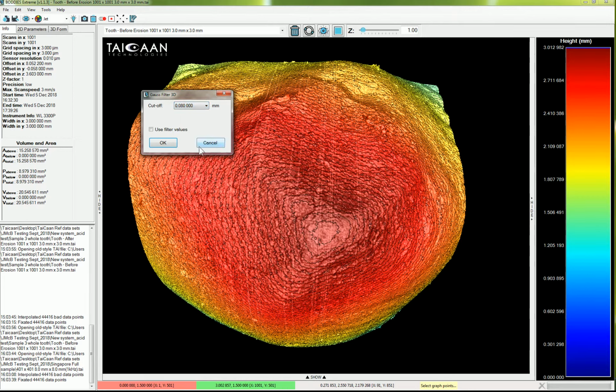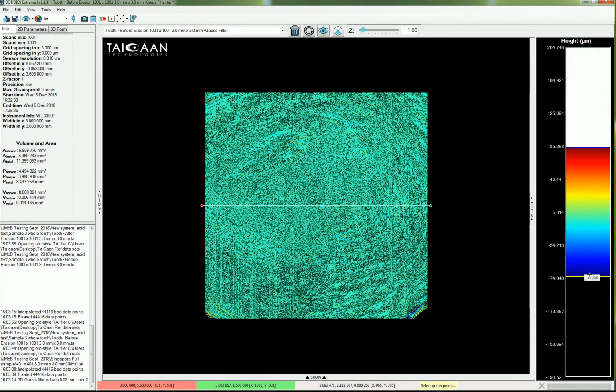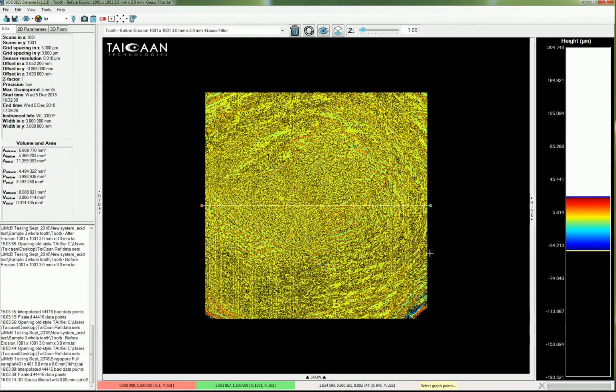We've applied the Gaussian filter to the whole of the surface, and if we want to see a bit more detail, we can, as we've done before, adjust the color scales here to try to bring some features out. As I said, this is not changing the data, this is just changing the color scale so that we can find a central region. And so here, bringing this in to a very narrow range, just here, like so. I think you can see the peak of the three-sided pyramid is here, with one leg going here, and one here.